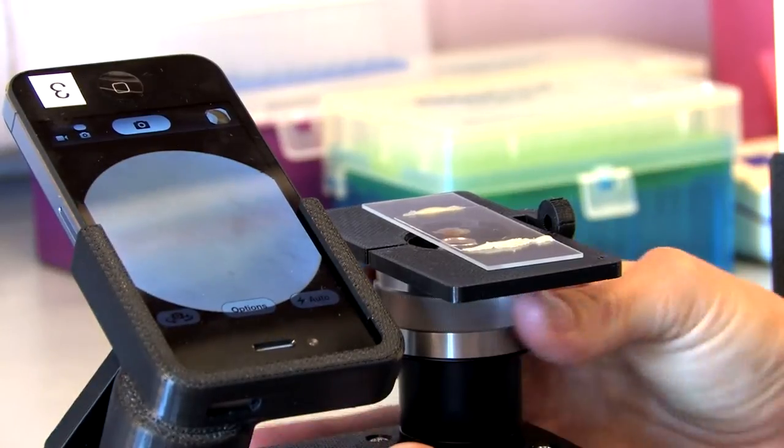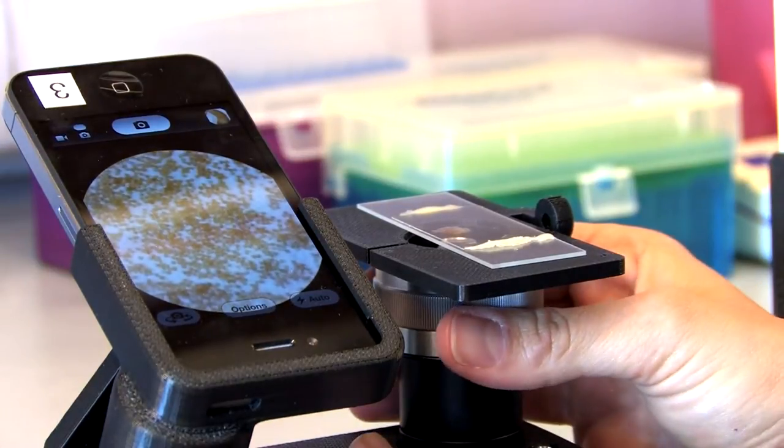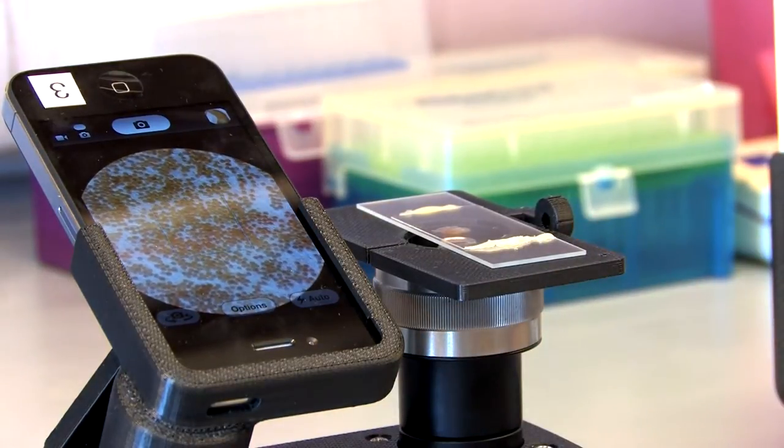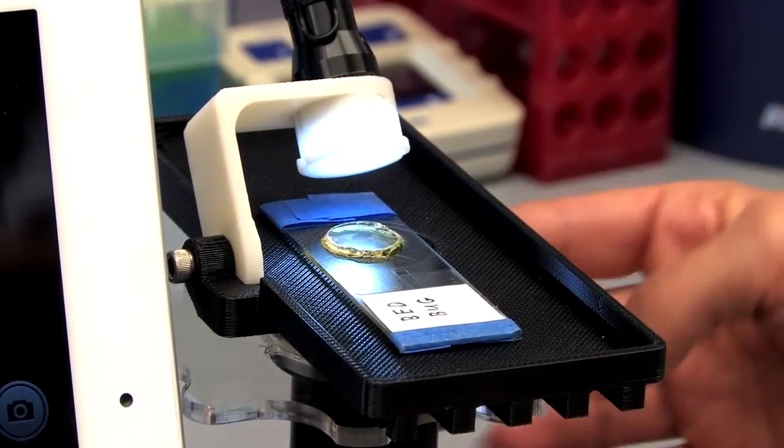The original CellScope that was developed was a very simple device that could use the cell phone as a camera and take pictures of microscopic samples. We print the parts, the plastic parts are printed on our 3D printer here in the lab.